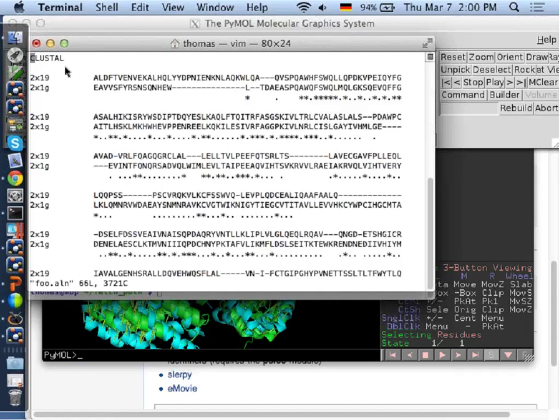Could you give a short explanation of the difference between the classes? Well, the first introductory class is for people that haven't really used PyMOL extensively or at all, and that's in the library. If you've been using PyMOL for several years and have made figures with PyMOL in the past, you're probably encouraged to go to the second session. We'll be learning how to make movies with PyMOL. So it'll be a bit more advanced class.